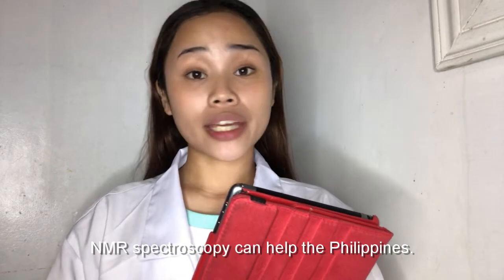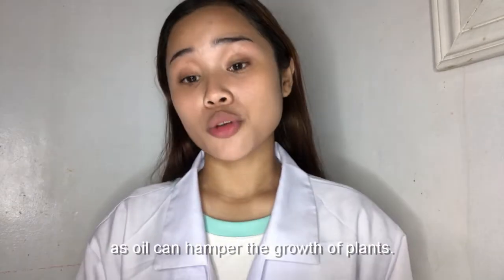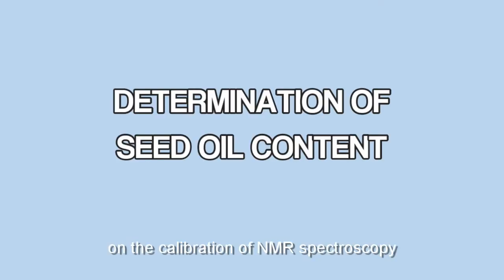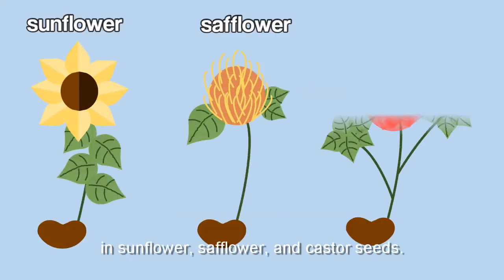NMR spectroscopy can help the Philippines. How? Determination of oil in plants is important as oil can hamper the growth of plants. Yadav and Murdy 2016 conducted a research on the calibration of NMR spectroscopy to determine the accurate estimation of oil content in sunflower, safflower, and castor seeds.